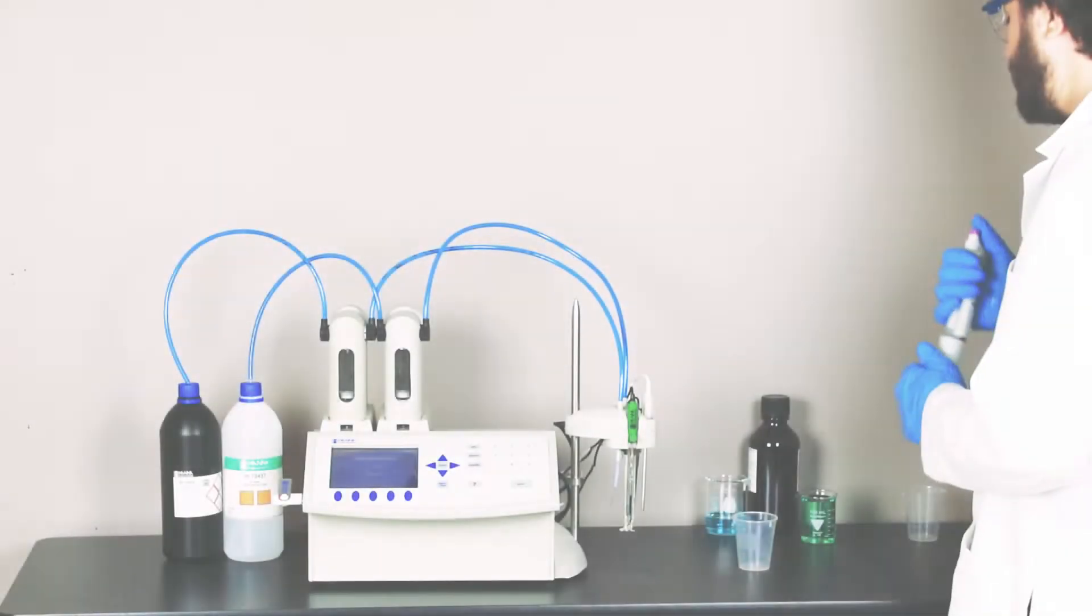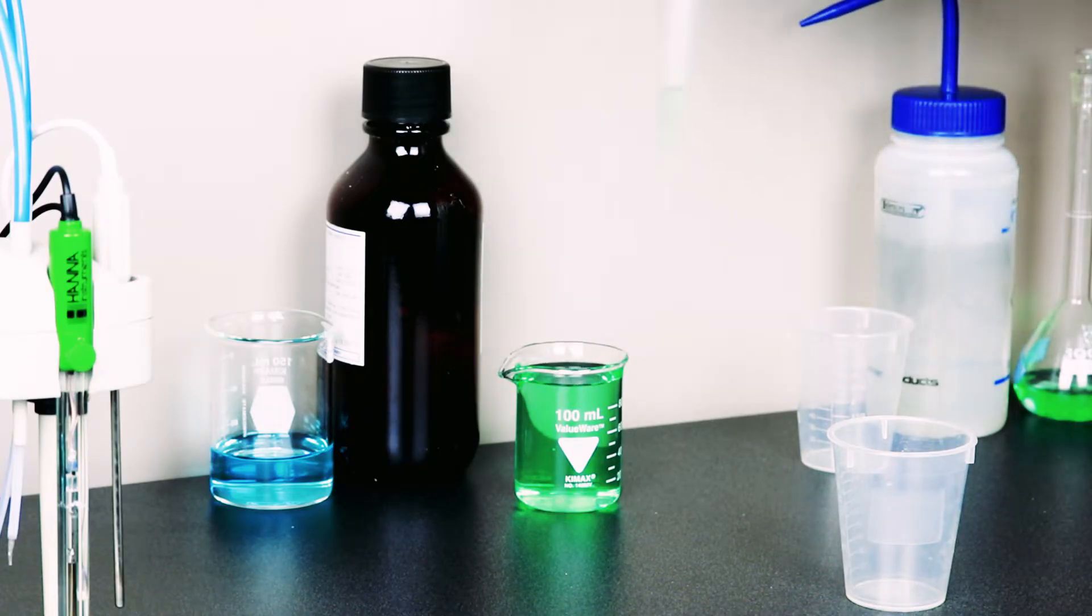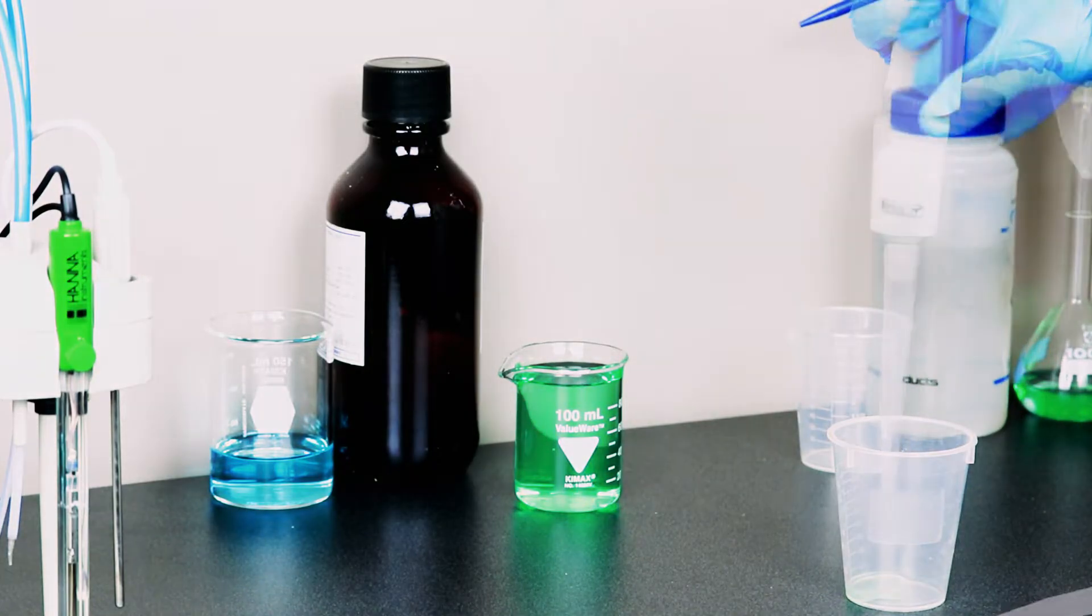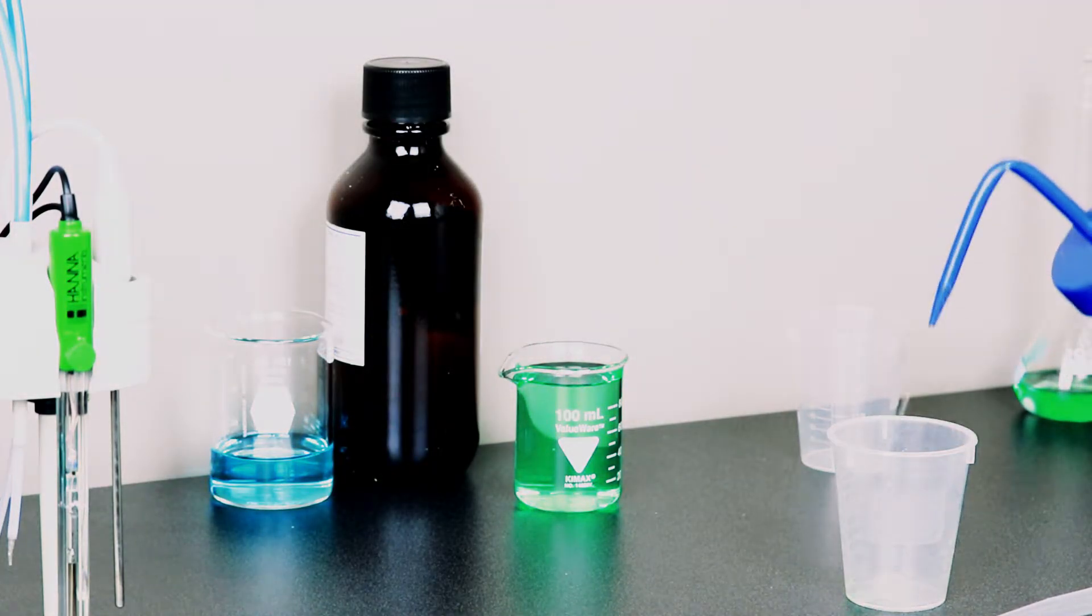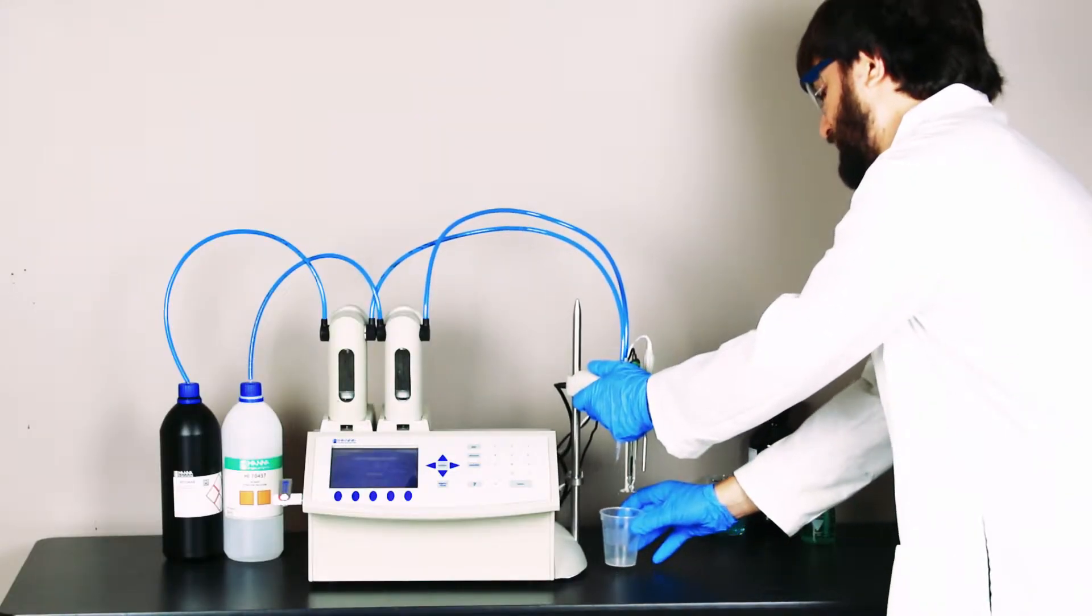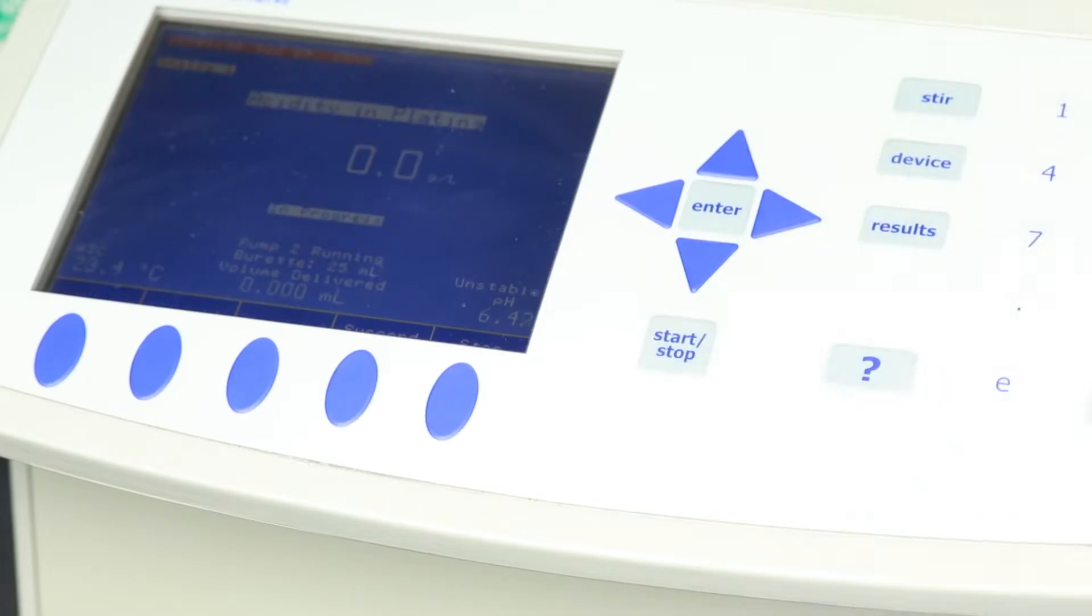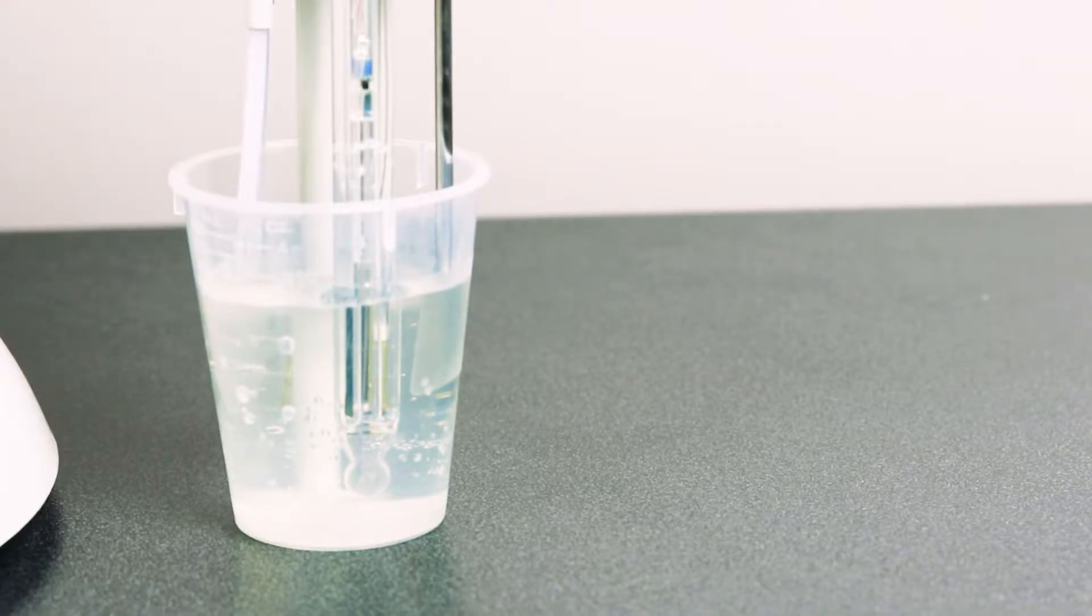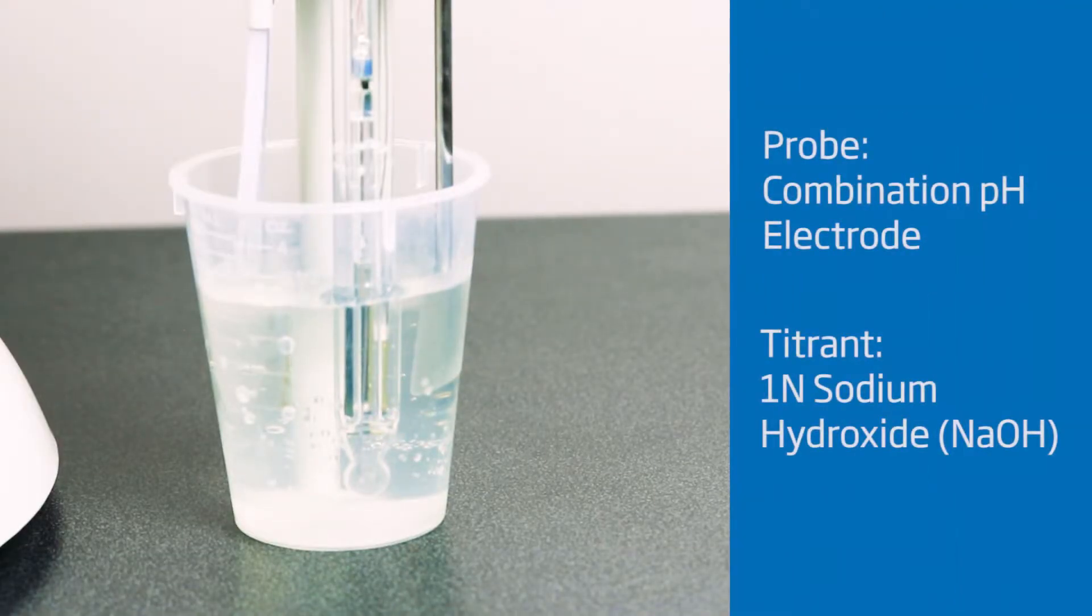To perform an acidity titration, simply grab your sample, add deionized water to submerge the electrode, and press the start button to begin the titration. The Hanna titrator automatically titrates the sample with sodium hydroxide to a pH of 8.2.